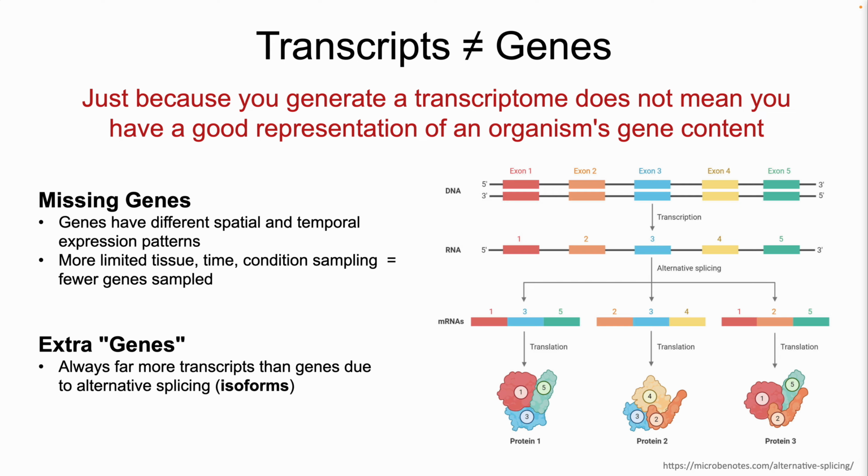Not always straightforward, and for the most part bioinformatics people are employed by clinical situations, or you're working in a mouse or a human lab where this is a little bit less of a concern because you've got a well-annotated genome. So there are 5 exons. You're going to map to that reference. Okay.